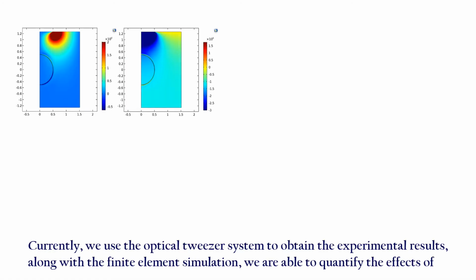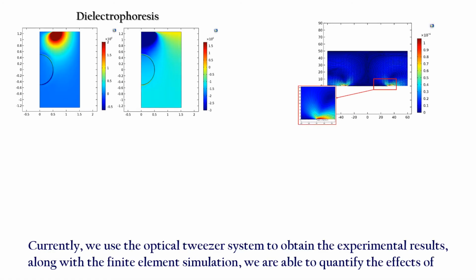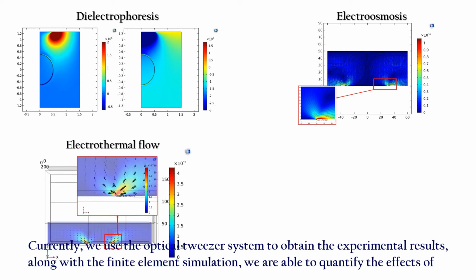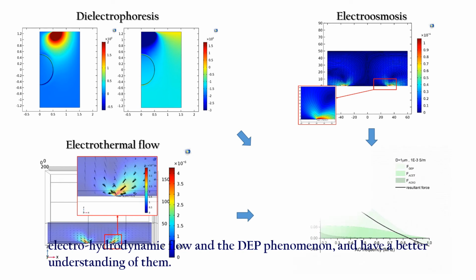Currently, we use the optical tweezer system to obtain the experimental results along with the finite element simulation. We are able to quantify the effects of electrohydrodynamic flow and the DEP phenomenon and have a better understanding of them.